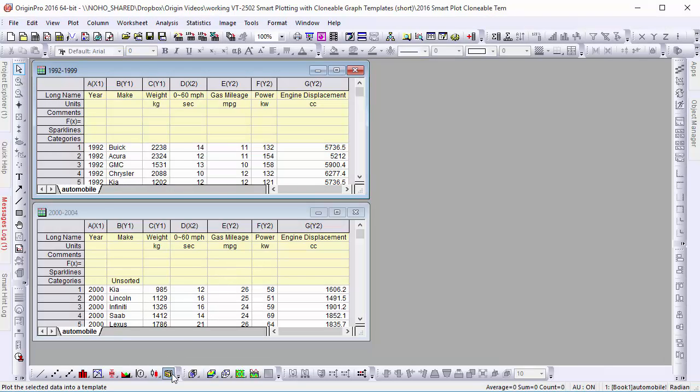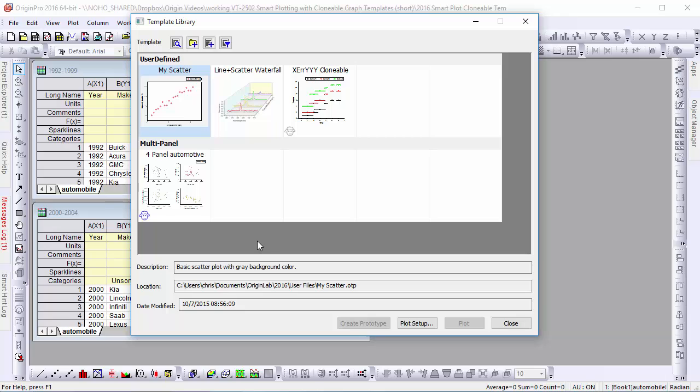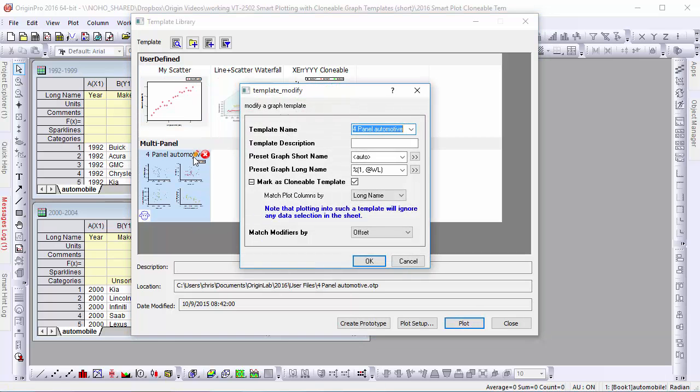Origin 2016 includes a redesigned template library focusing only on user-defined graph templates. From within the library, we can edit a template, including its name or description.